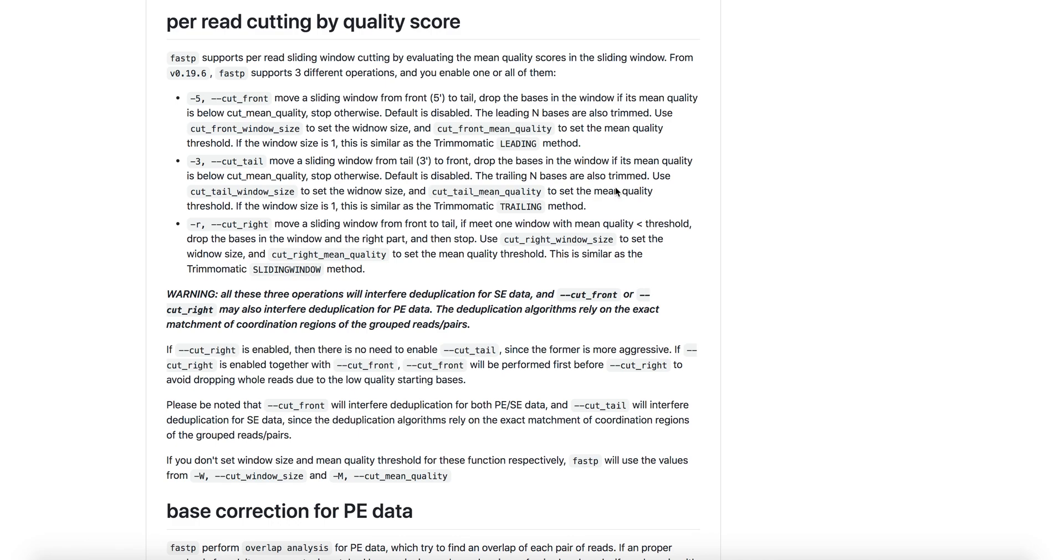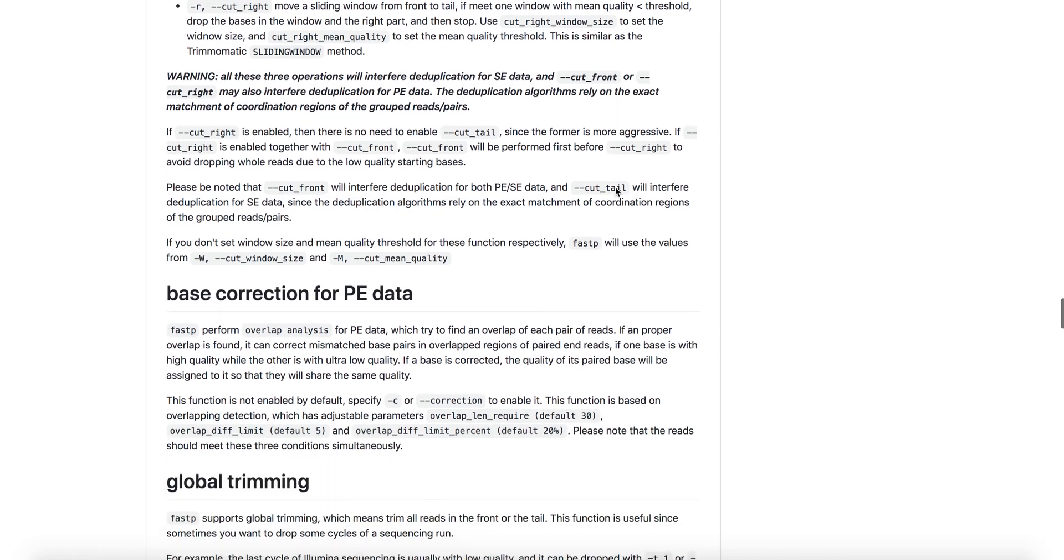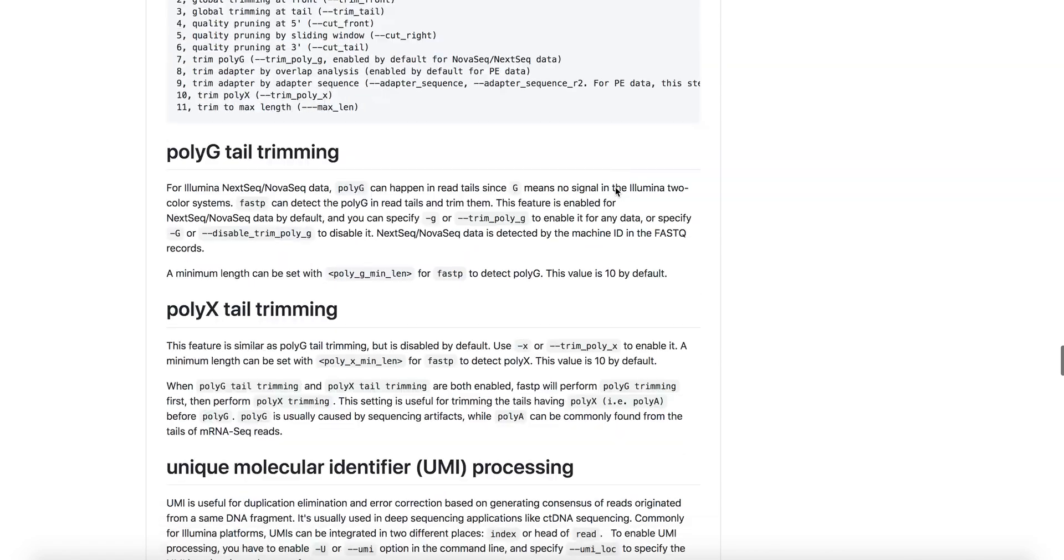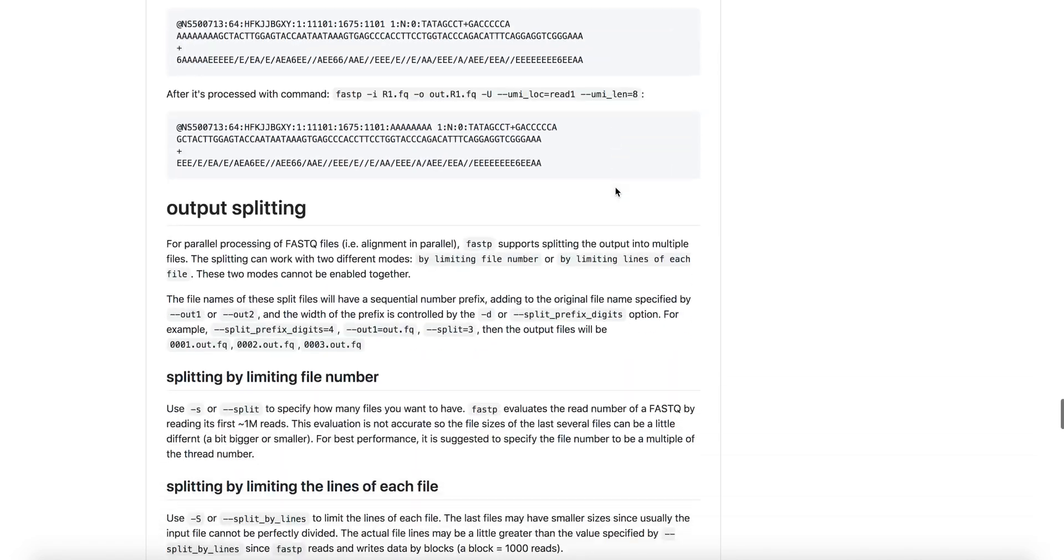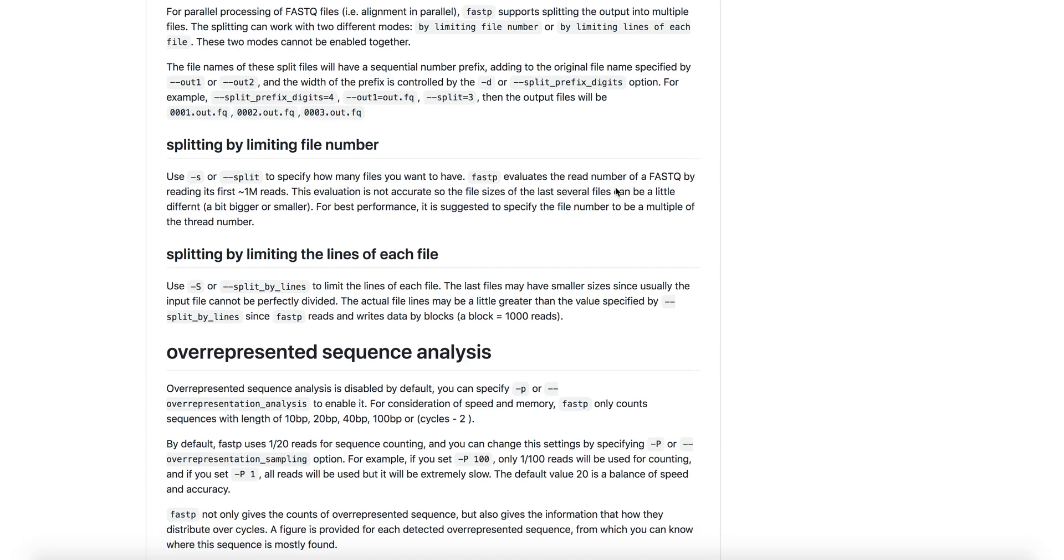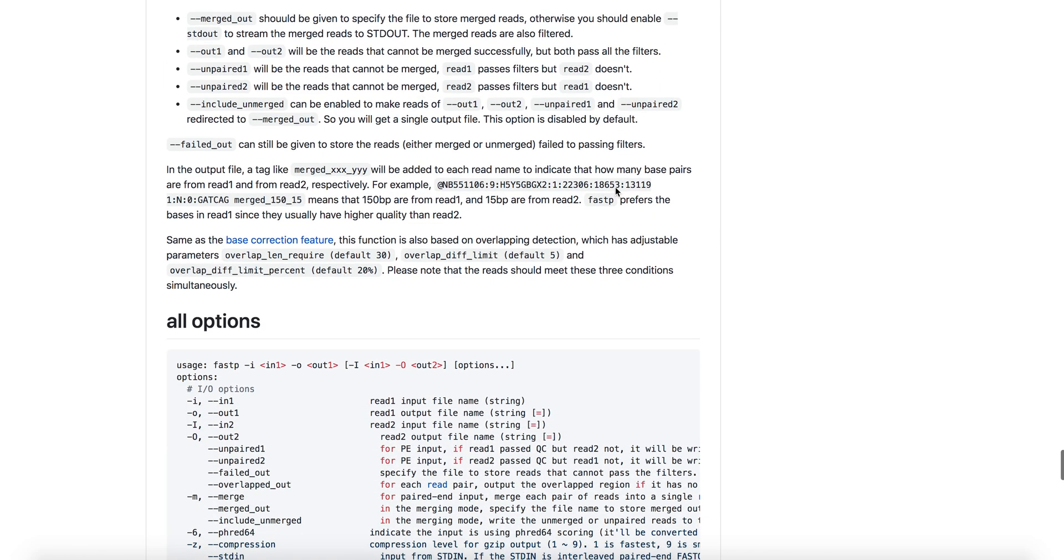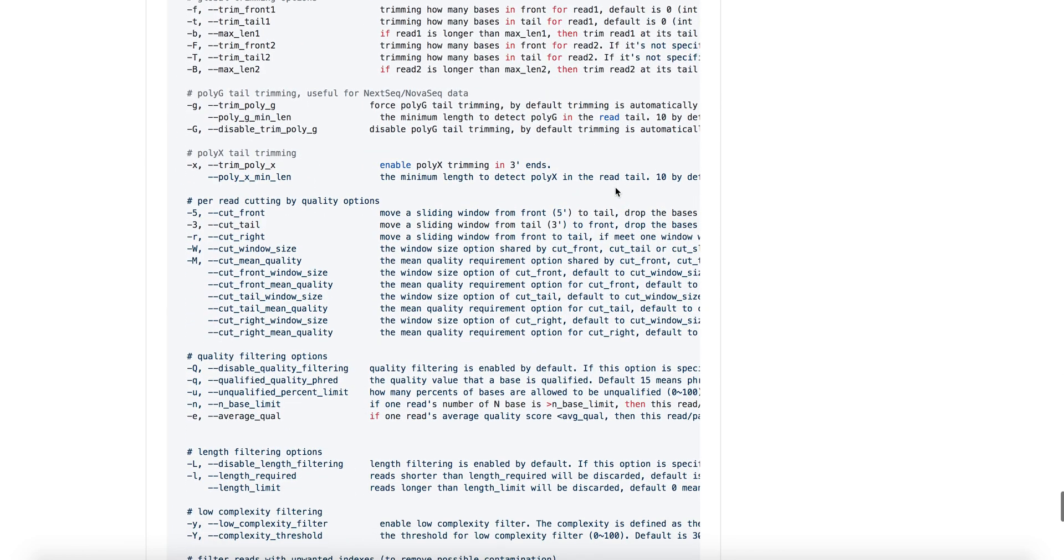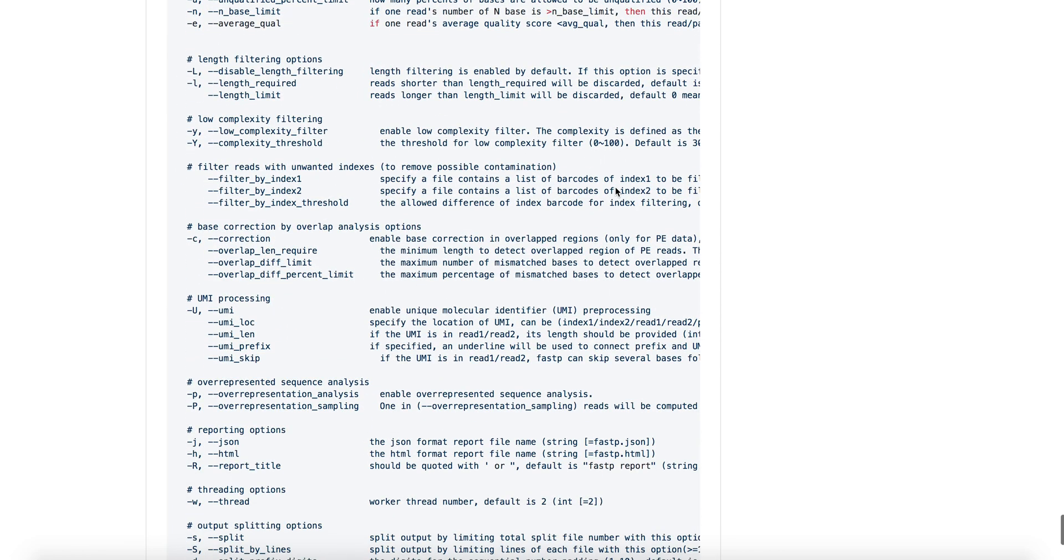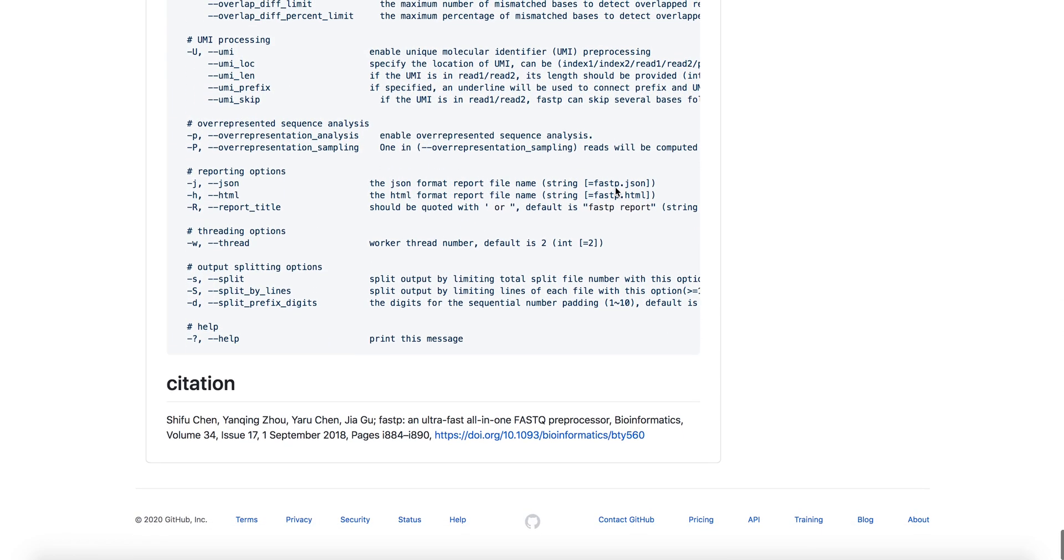It also does quality score trimming on the front and the back in order to remove reads that have a low base quality call score from the sequencer itself. And you can see there's a lot of other kinds of processing, splitting of files, etc., that it performs based on all of these different command add-ons. I would highly recommend that if you're going to use FASTP, you look through the GitHub page and figure out which of these options are relevant for your application, relevant for your type of FASTQ preprocessing.